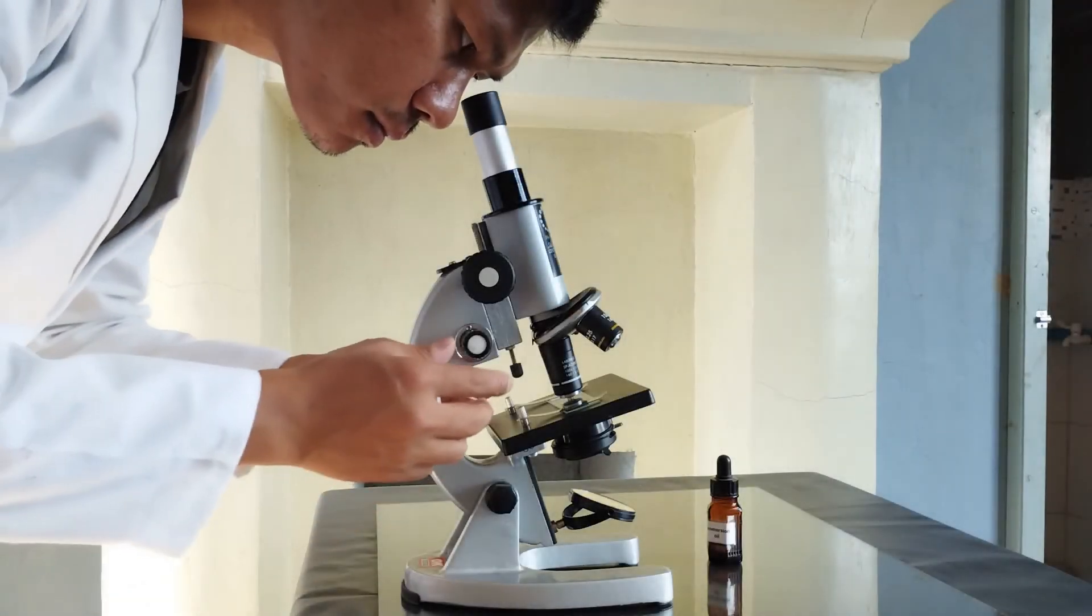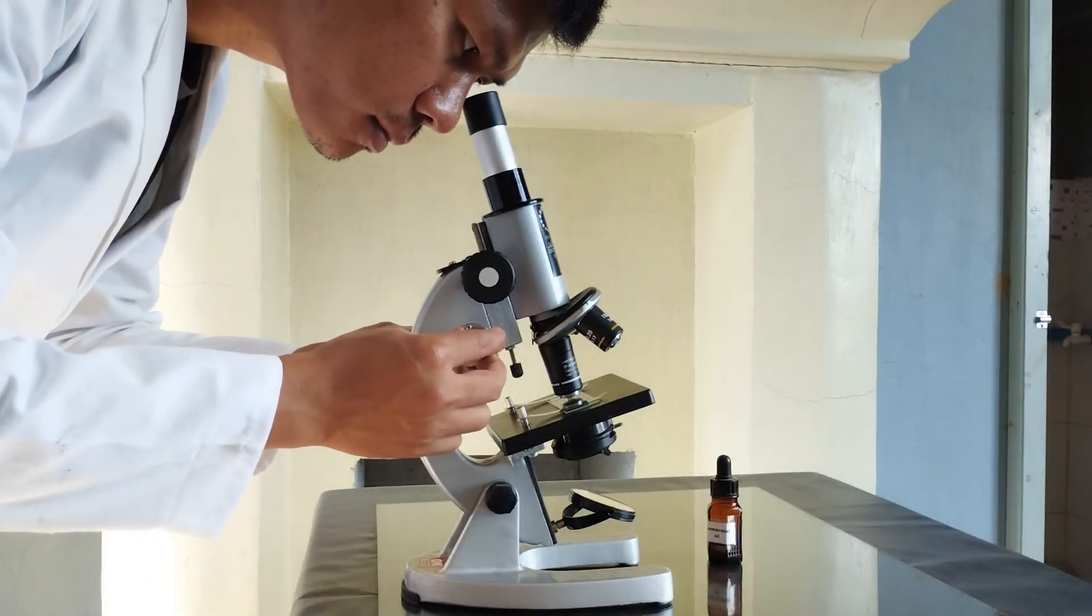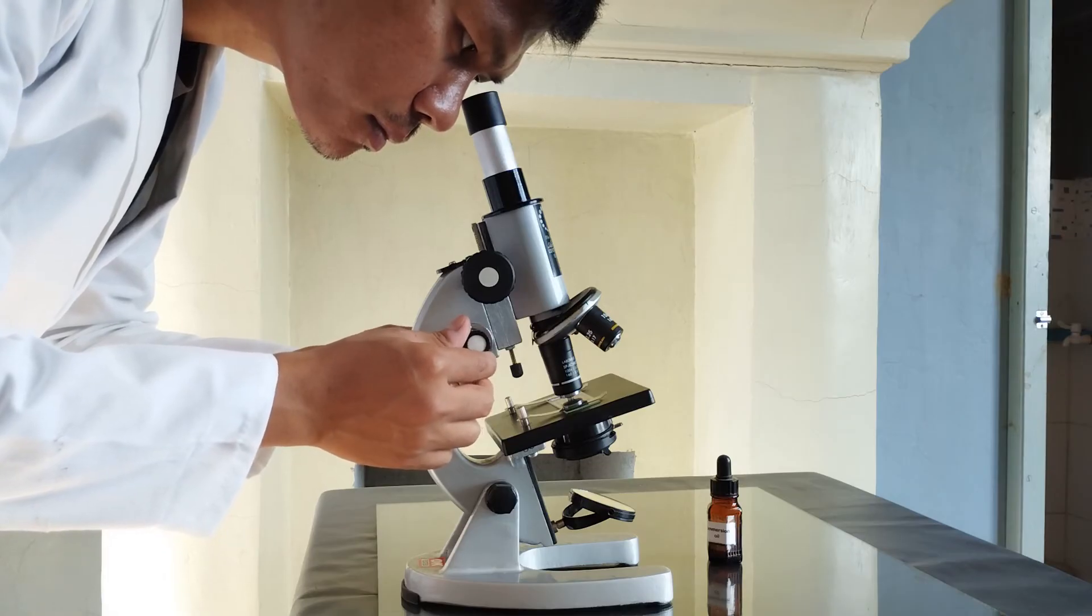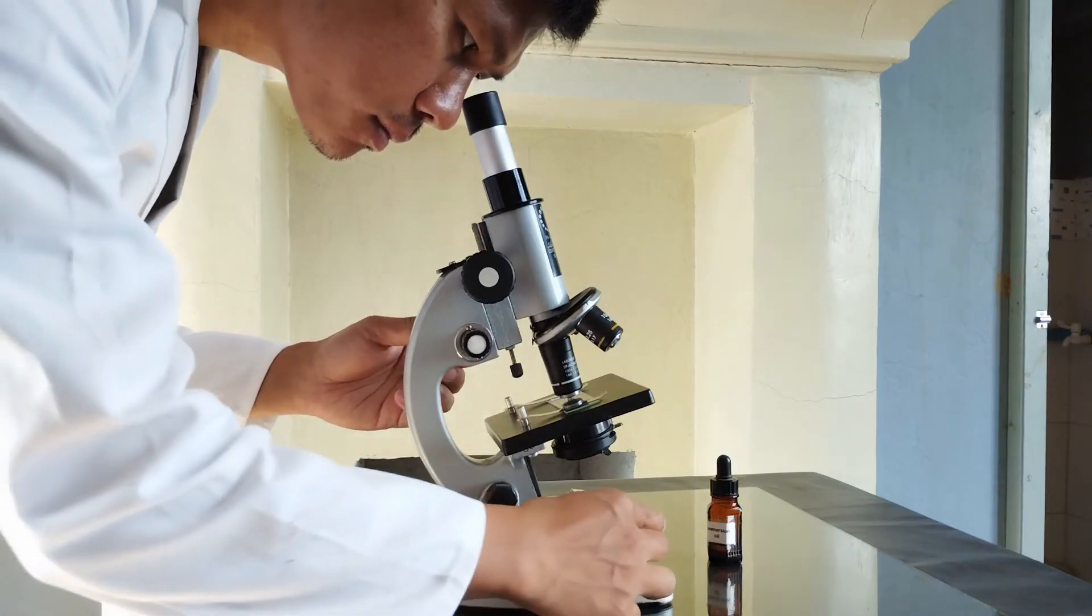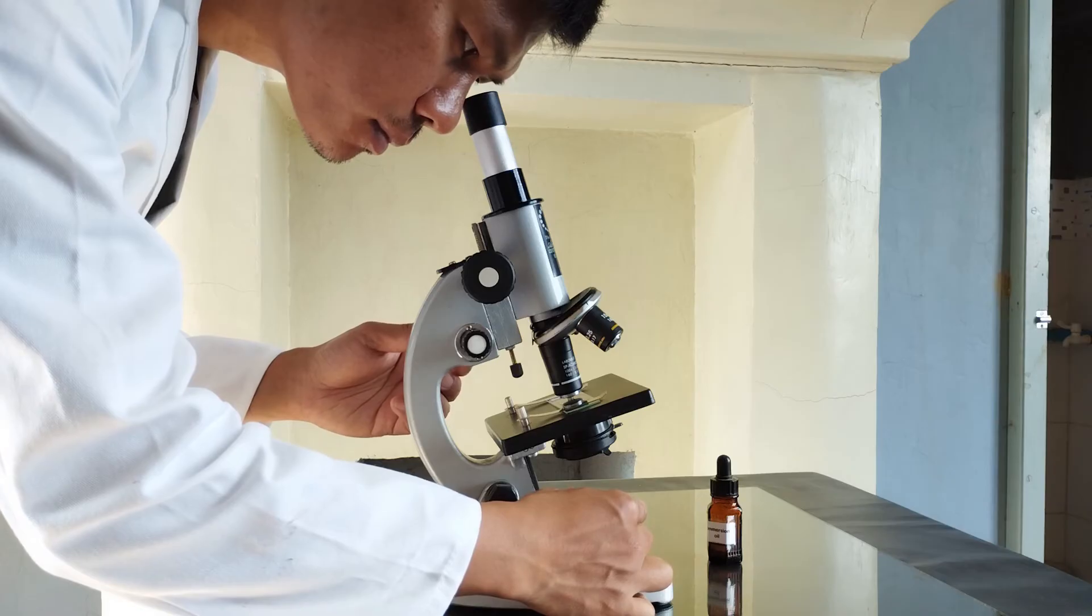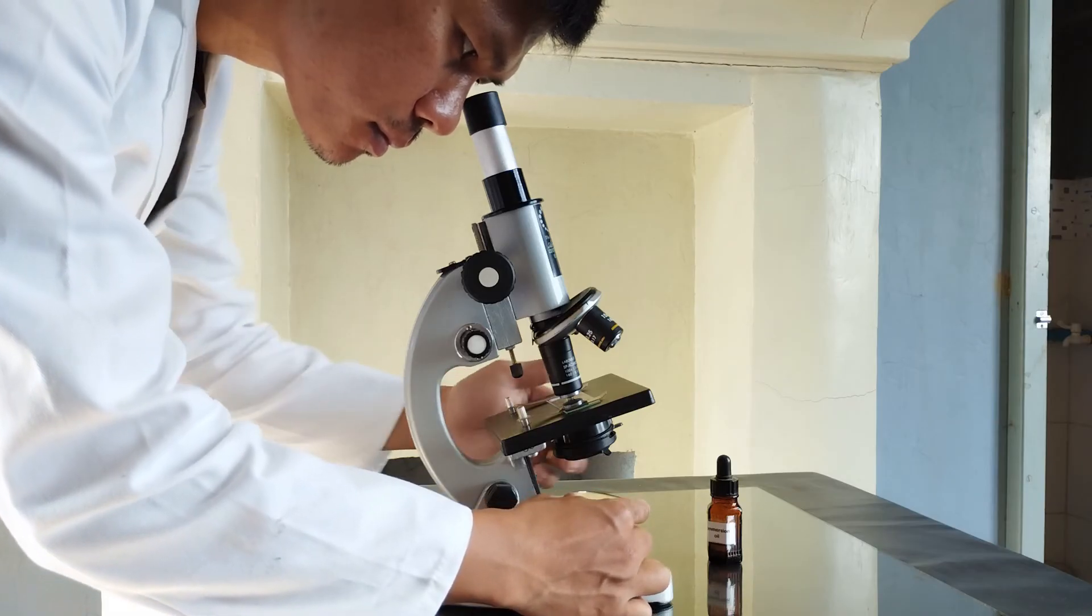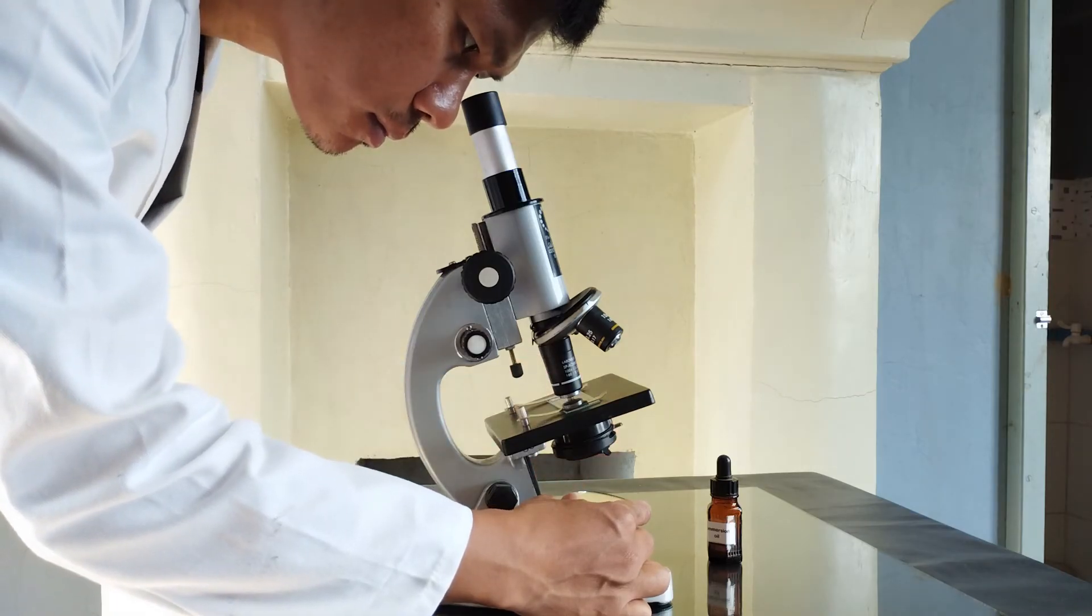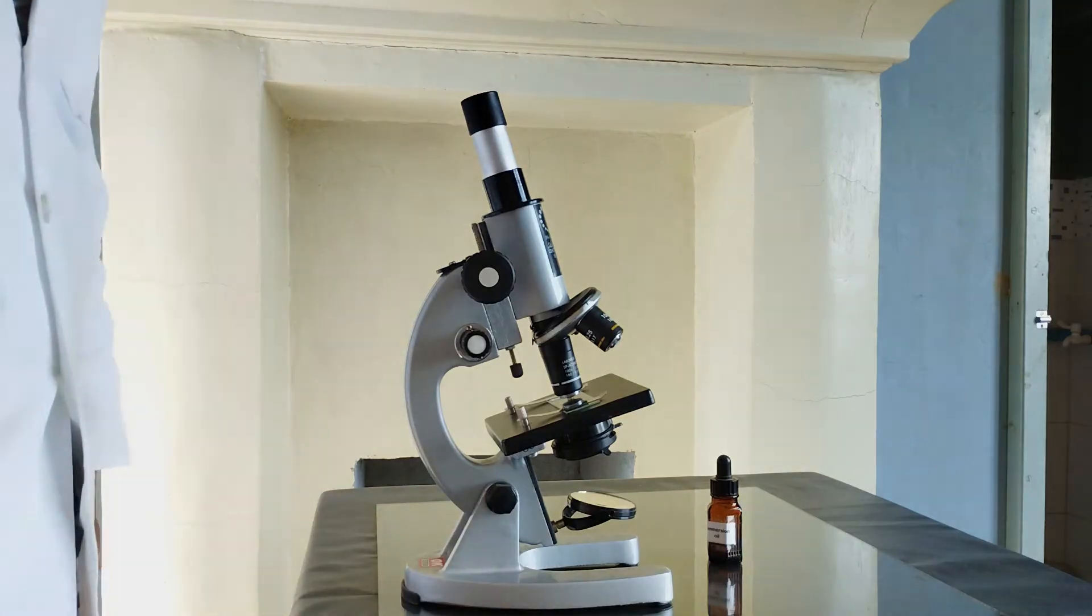Then carefully lower the objective lens until the external lens touches the oil surface on the slide. Now view through the eyepiece and focus the specimen using only the fine adjustment knob. Again, you might need to readjust the lighting for maximum contrast and ideal brightness. Oil immersion objectives require a more intense light source for satisfactory results. Inbuilt artificial light source such as halogen or LED lamp is therefore mostly used when working with immersion objectives.